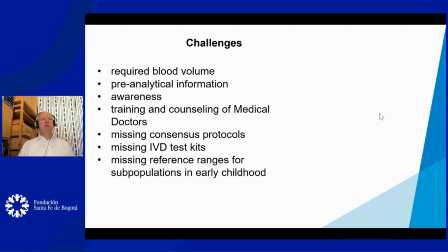The pre-analytical information is very important. Without a correct information from the clinician, we cannot decide what to analyze. When I get blood from a child and the question is only immunodeficiency, I can do exactly the wrong investigation, for instance, when this immunodeficiency has to be seen in the context of a bone marrow transplantation. So I have to combine the correct tubes for the investigation dependent on the clinical information from this child.